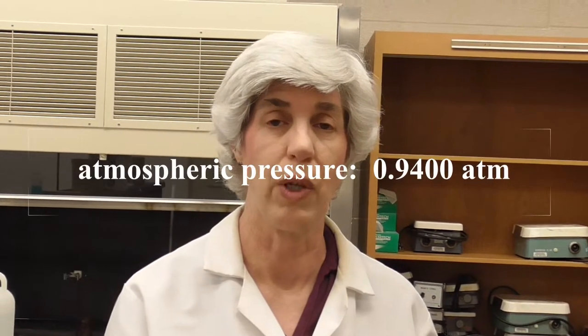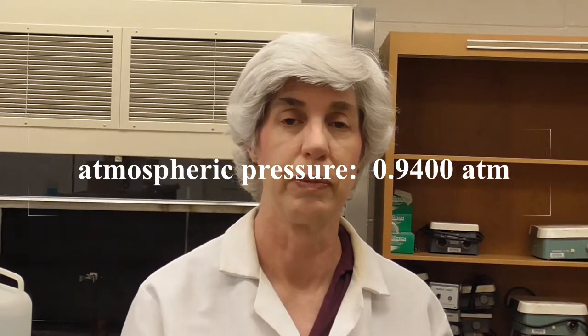And also you see in the lab manual it says that we need to know the atmospheric pressure today. So we have measured that, and the atmospheric pressure today is 0.9400 atmospheres.